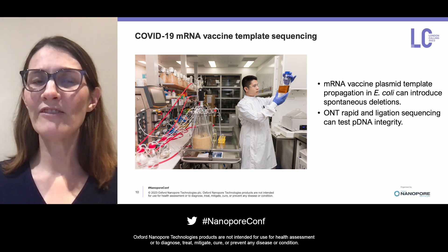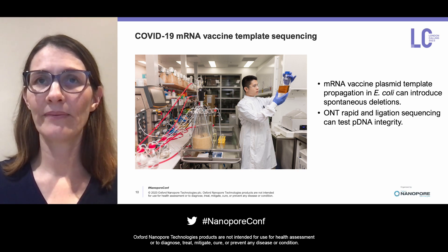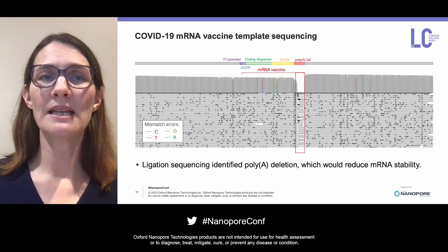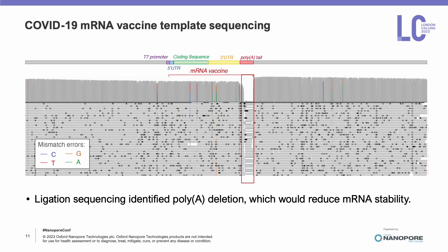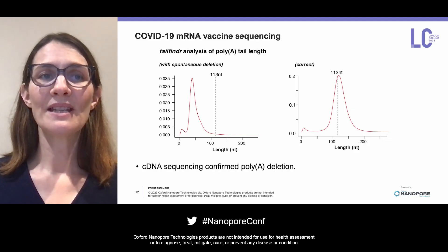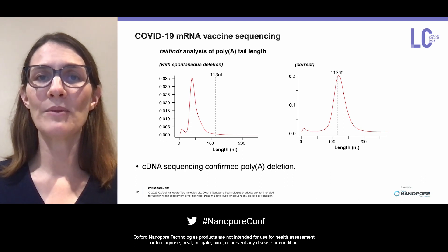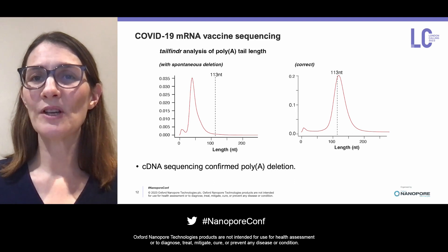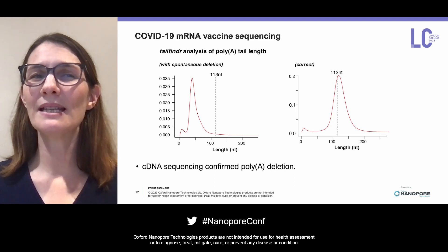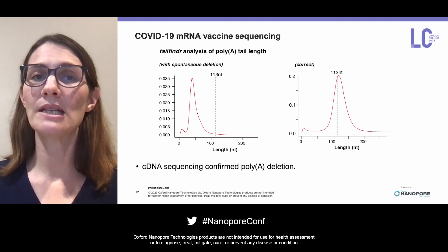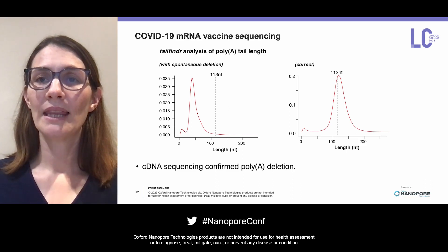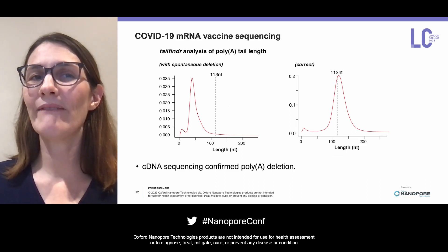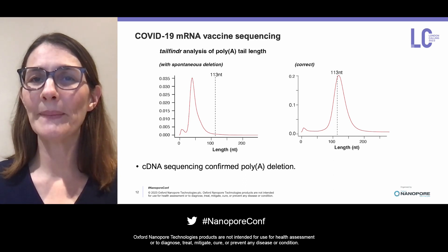Here are some data from one of BASE's mRNA vaccines and its plasmid template. From this IGV plot of ligation sequencing of a plasmid template prepared as part of routine manufacturing, you can see that there's very low coverage at the area of the poly-A tail, suggesting a spontaneous deletion in this region. This was confirmed by tail finder analysis of the in vitro transcribed mRNA vaccine, showing that the observed poly-A tail length was significantly shorter than the intended length of 113 nucleotides. As poly-A tail length is important for stabilizing mRNA vaccines and for their intracellular activity, the plasmid template was then re-synthesized.